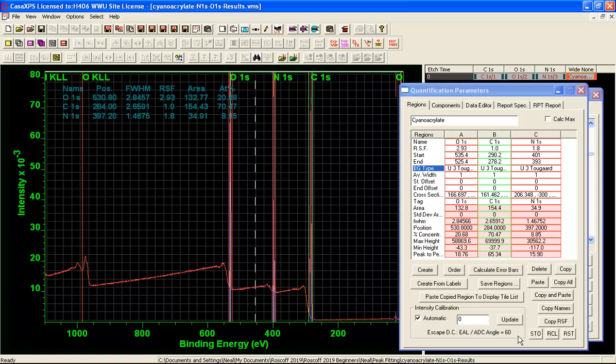And the angular distribution was 60 degrees but these are all S orbitals so there is no modification to the RSFs. If they were P, D or F orbitals then there would be a modification based on an angle of 60 degrees. But in this instance there is no correction required.